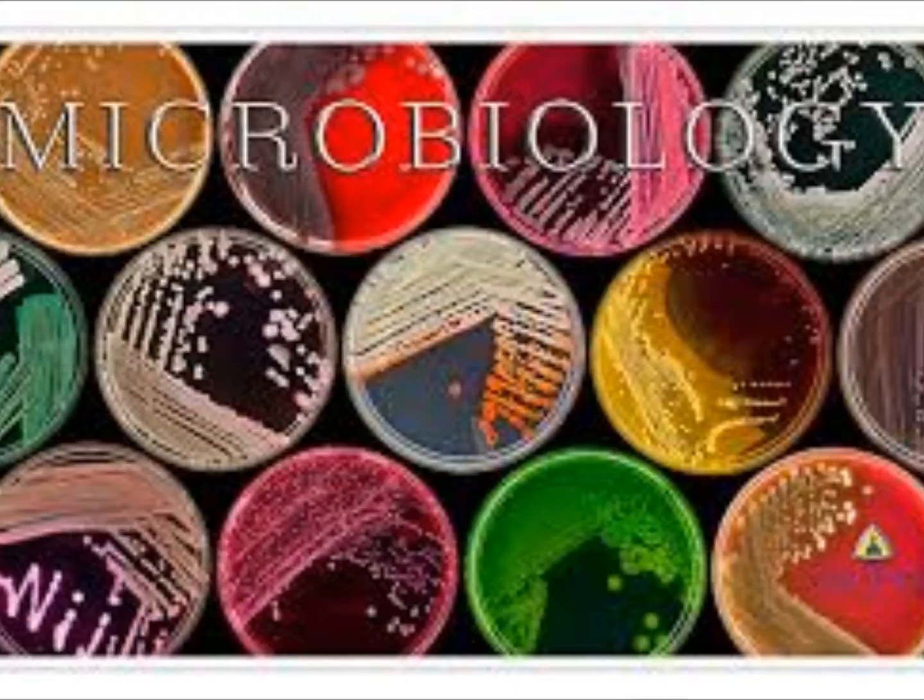I put them out there, and I think they all looked at them with the size plates. But you can see where it's distinctively different, and that really helps when you've got multiple colonies on a plate. Sometimes it's hard because you might have multiple white colonies, and on the first day, you can't tell the difference. They all look like the same colony. Then on the second day, you might see a little variation in color.